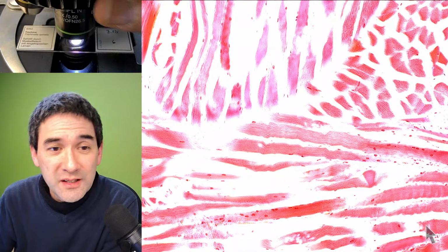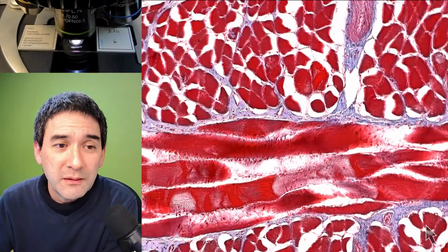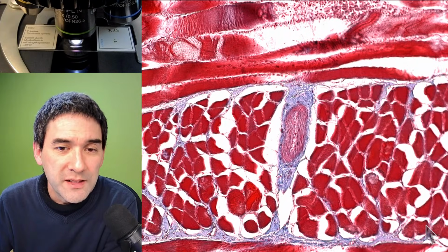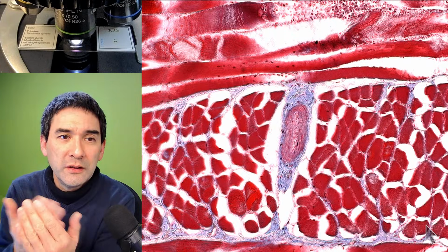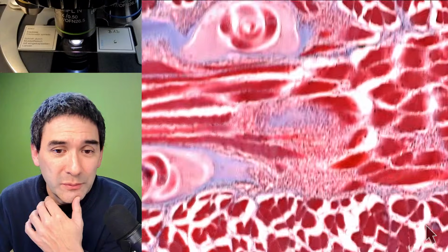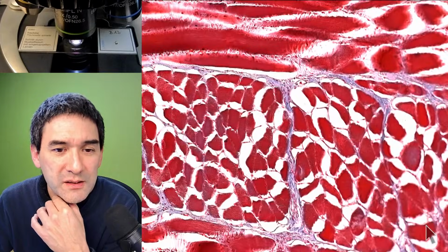Again, that's one of those pathological slides that you can only get from those special companies that are actually making them. This one, for example, here in the center, that's a blood vessel, a cross section of a blood vessel. You see that some of the muscles were cut longitudinally, others transversely. That's the correct term. So, 2 cysts, but I think there were a couple more in here somewhere. It also appears to be a blood vessel somewhere.